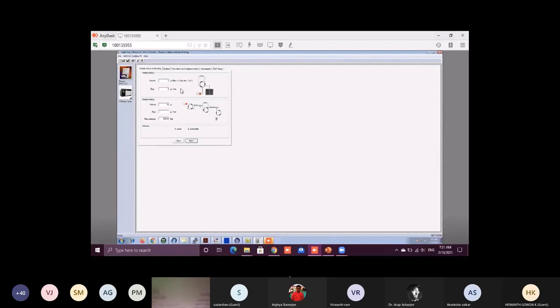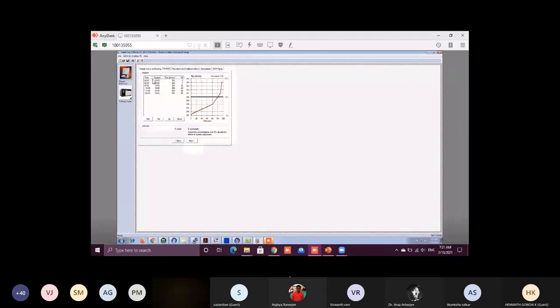Now these are the important parameters which you need to know. First is the sample pickup and loading. Then, for sample loading, what is the maximum pressure that can be maintained. In the case of the gradient, here comes the main point: how much gradient time you are using.